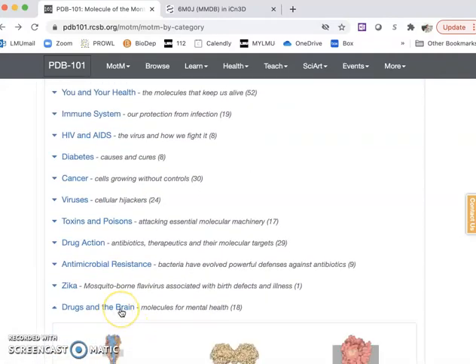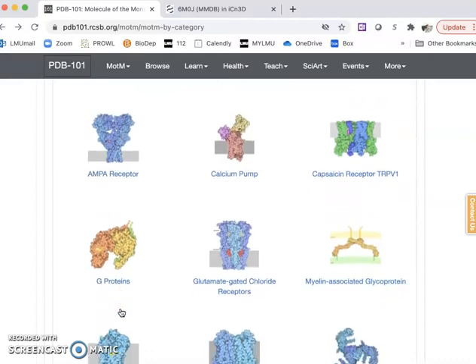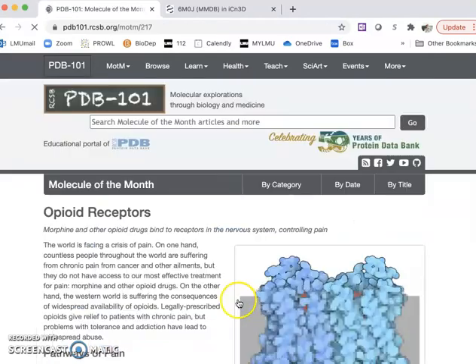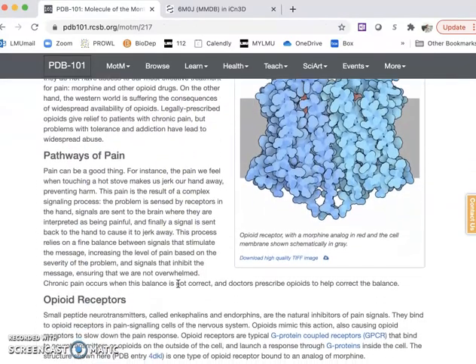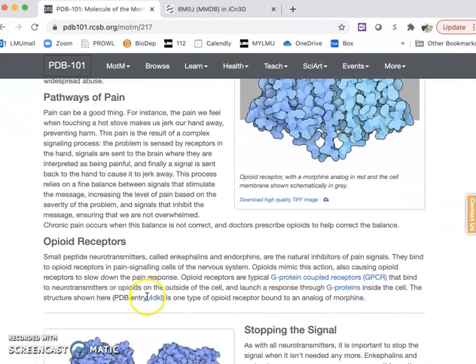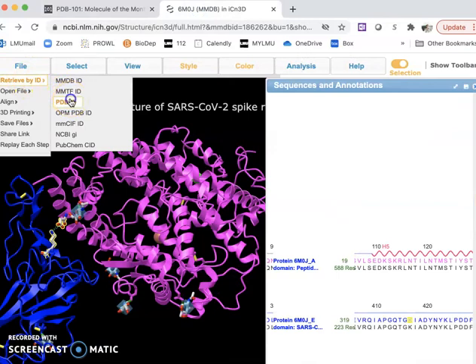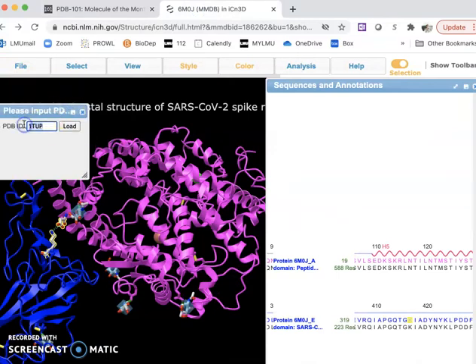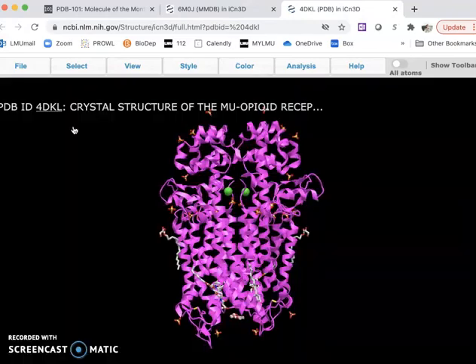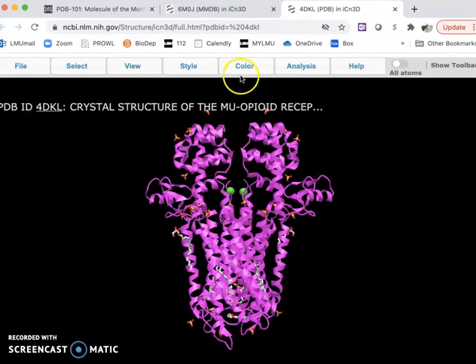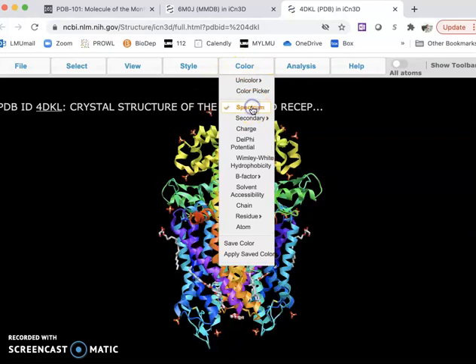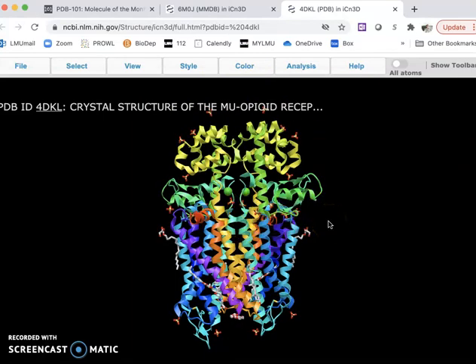It sounds interesting, and I would select this PDB code and use it right here to see this opioid receptor in 3D dimension. I do like it as a spectrum.